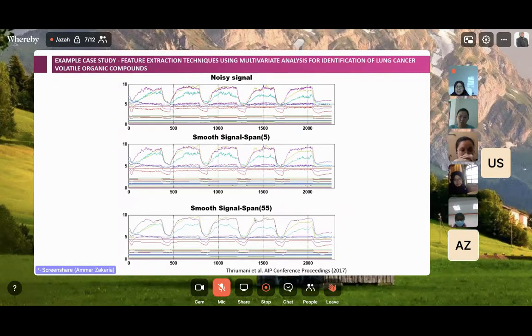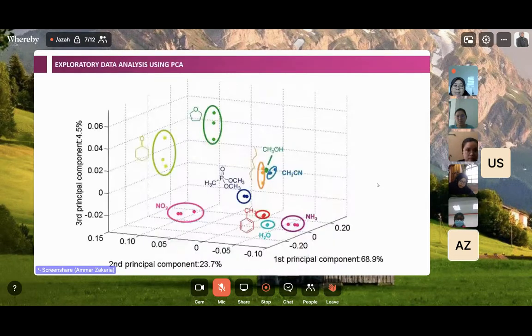So normally you need to take a look at your data. If you take the maximum peak of each individual cycle, then this peak might not be consistent. But if you take the last point before you are purged, you might get quite consistent readings. So this is another strategy when you apply feature extraction. First of all, you need to really understand the behavior of your data before you decide on the next step.